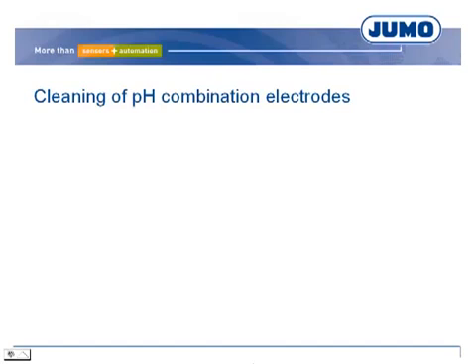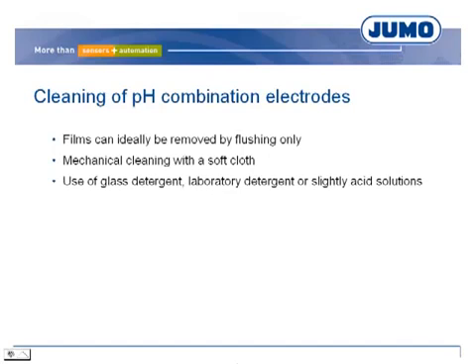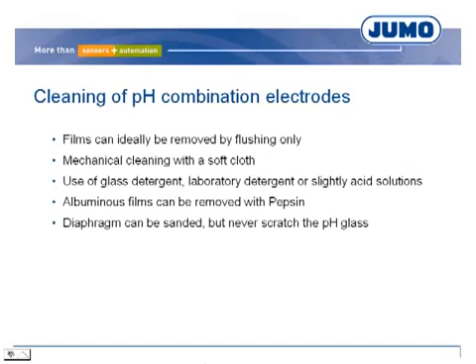When the measurement system shows an error, such as unrealistic values, cleaning the electrode often provides a solution. The best method is flushing the electrode with distilled water, but never store electrodes in distilled water due to desalting. A soft cloth can also be used. For cleaning, glass detergent, laboratory detergent, acetone, alcohol, or slightly acid solutions such as 10% hydrochloric acid can be used. Albuminous films can be removed with pepsin. In case of heavy pollution, the diaphragm can be sanded, but never scratch the pH glass and never use abrasive detergent. After cleaning, the electrode must be flushed with distilled water and a calibration must be executed.